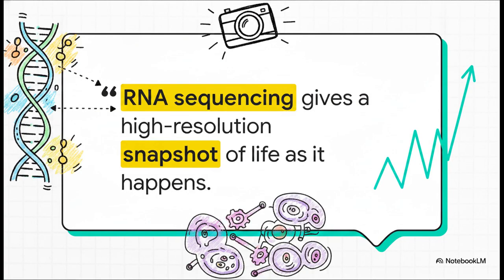To sum the whole shebang up, RNA sequencing isn't just about reading a static code. It's about reading real-time activity. As we've seen throughout this explainer, RNA sequencing gives us a high-resolution snapshot of life as it's actually happening, opening up this incredibly dynamic window into the very machinery of our cells.